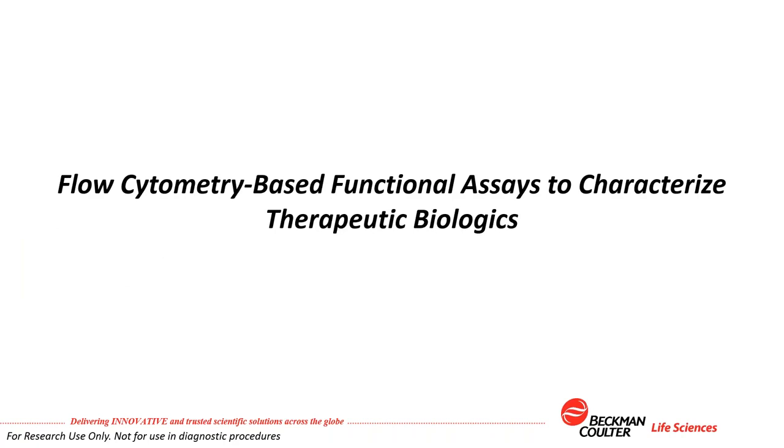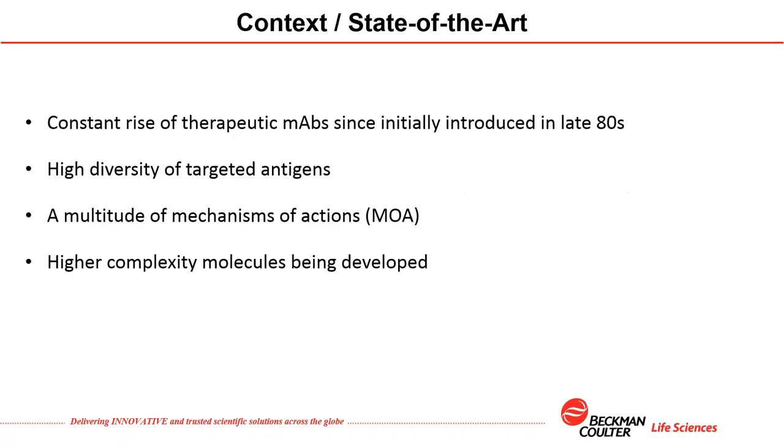And now what I would like to share with you are some results that we've been obtaining in another field. This field also deals with flow cytometry-based functional assays. But in that case, the questions that were asked were more in relation to the characterization of therapeutic antibodies.